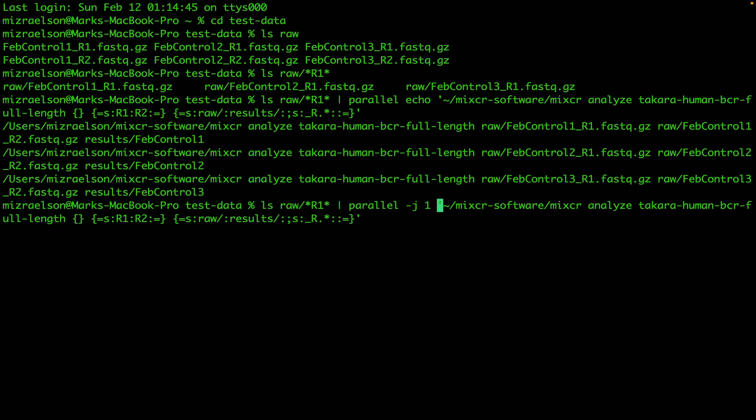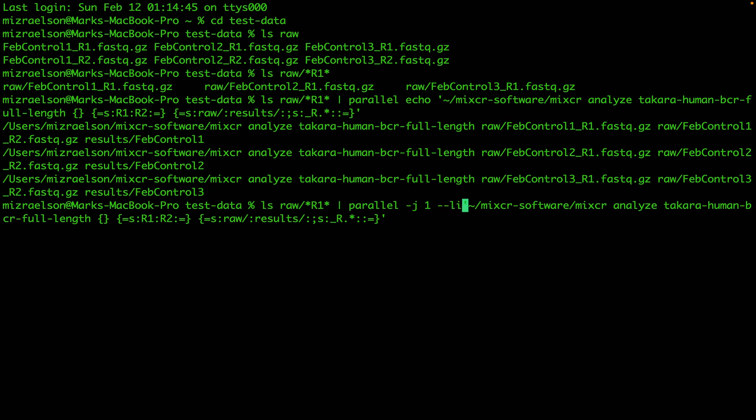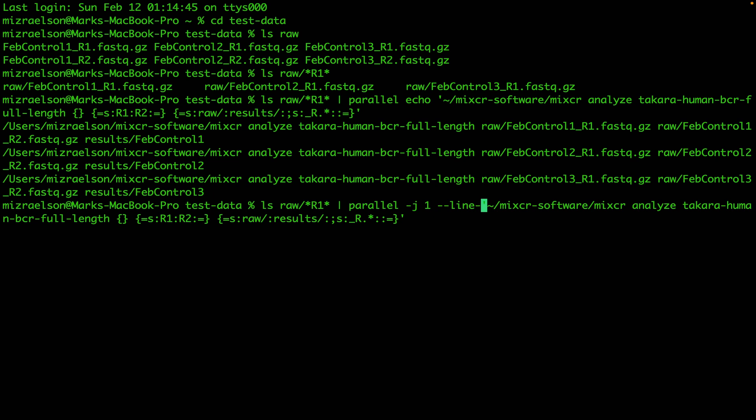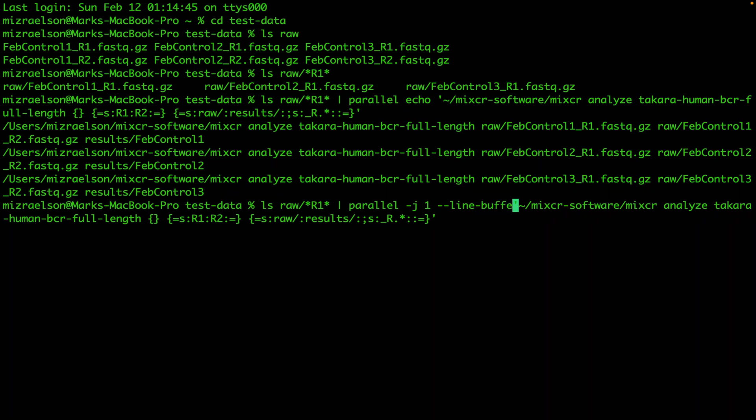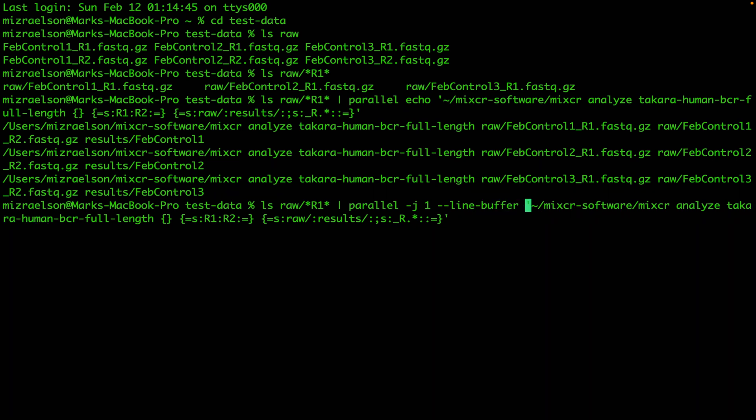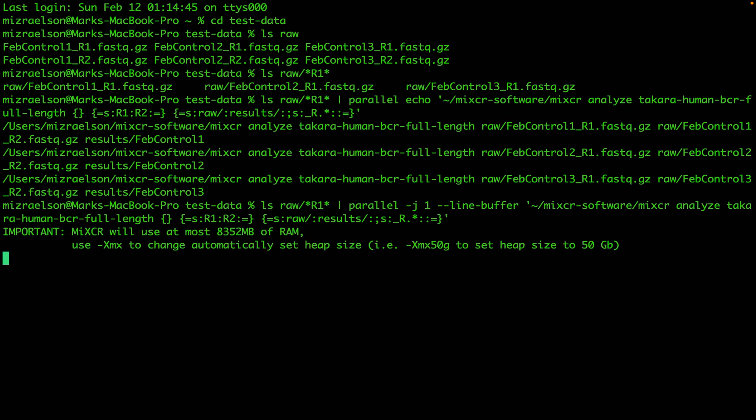Another parameter is called line-buffer, so we can see the progress in the standard output. Now I'm just gonna hit enter and the analysis has started.